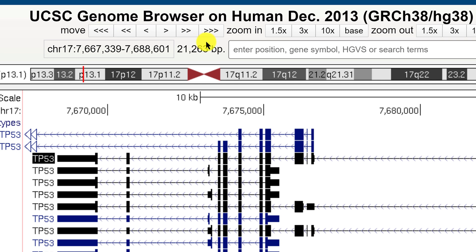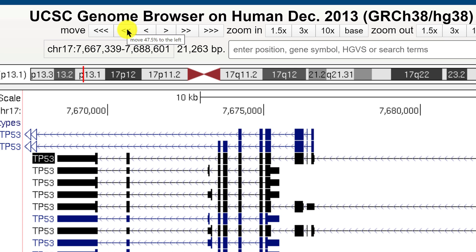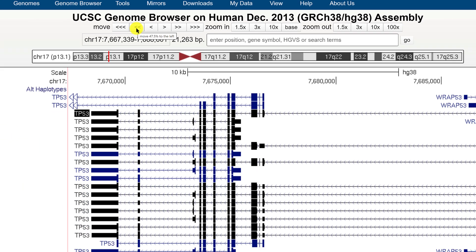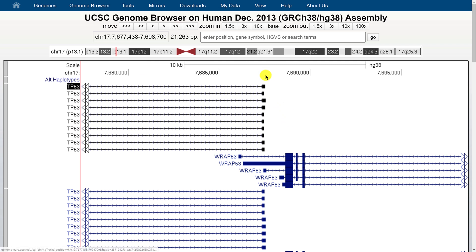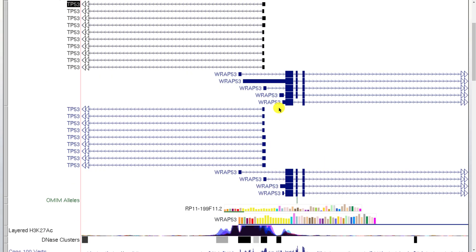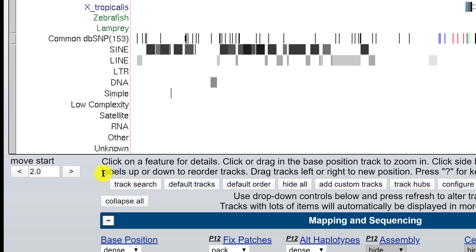There are also left and right arrows — hovering shows a tooltip. The triple arrows move 95% to the left or right, the double arrows move nearly half a browser window, and a single arrow click moves just 10%. Using the double arrow to the right, we can move the start of the p53 gene and its promoter more towards the middle of the view.